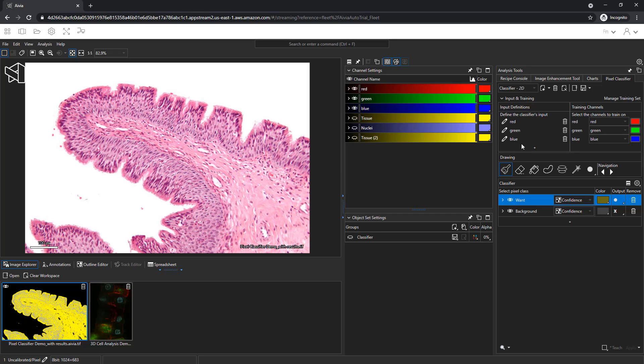The drawing tools are the primary method for defining teaching regions on the image. And below the tools are the two pixel classes, want and background.